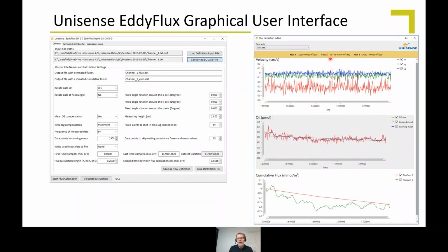Flux number two is calculated using the linear regression as the average. So for each data point, the distance between the corresponding linear regression value and the measured value is calculated and summed up for the red line down here. So the increase in oxygen uptake over time.